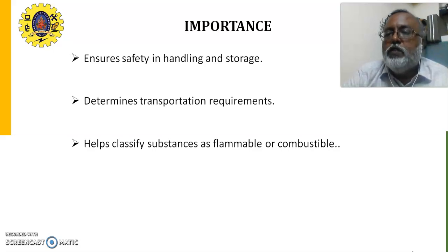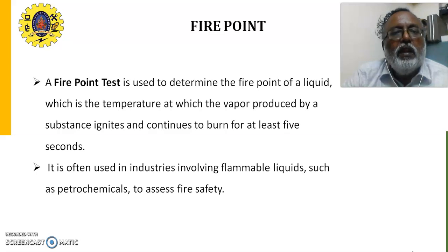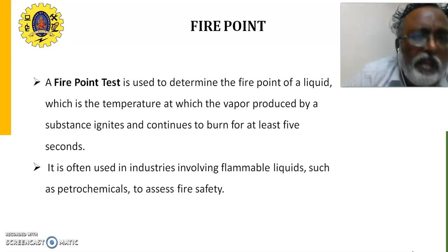So, we use the flash point test for ensuring safety in handling as well as storage of fuels. Second, to determine the transportation requirements, and third, to classify substances as either flammable or combustible. Let us come to the fire point.